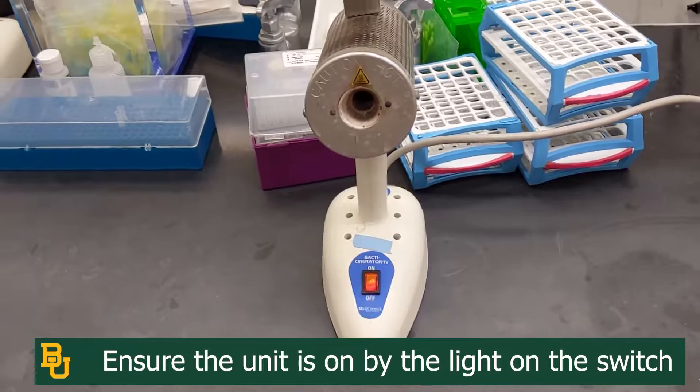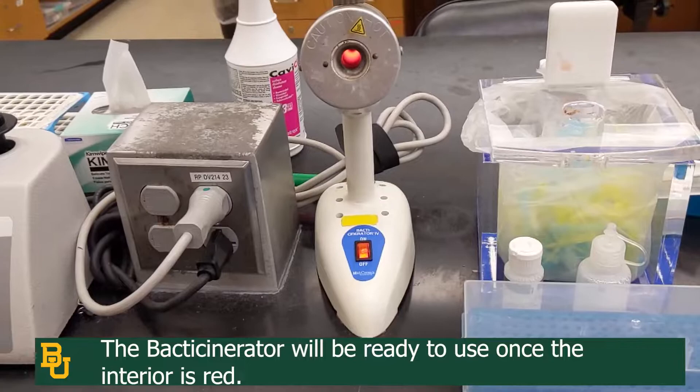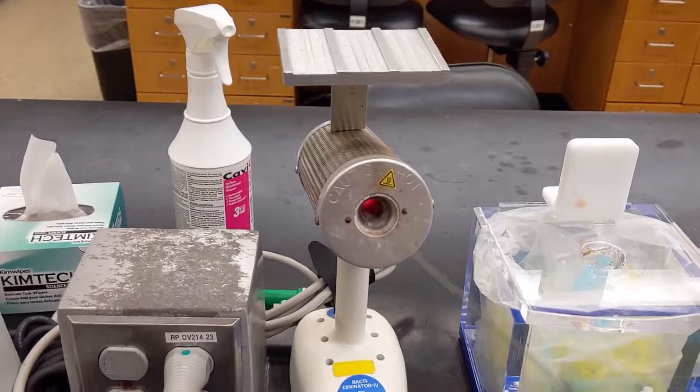Once it's in place, make sure to press the on switch. This takes approximately five minutes. You'll know it's on by the light. Here's an example of one that's on and hot — you can see that it is hot because of the orange glow on the inside.